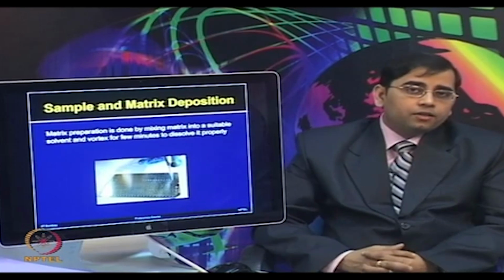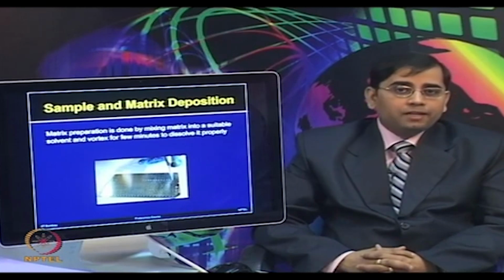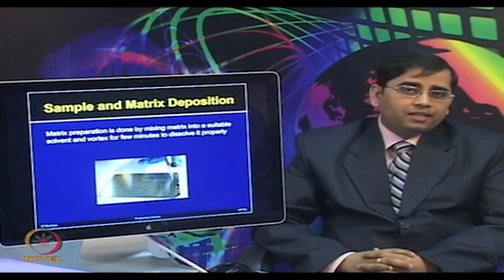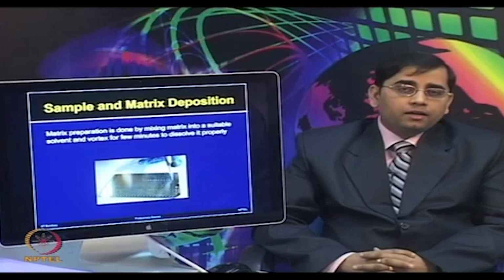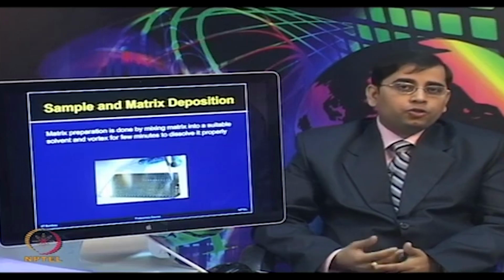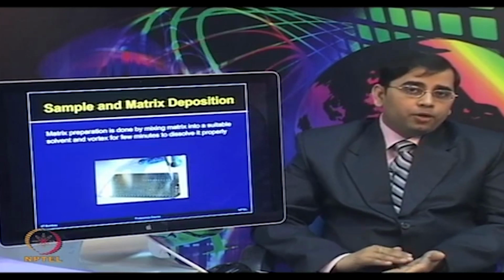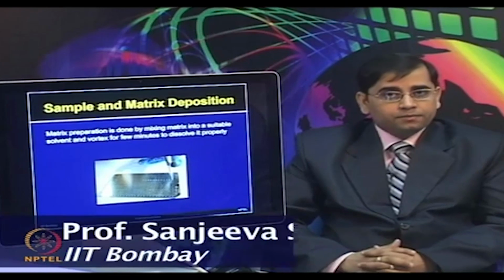Another way is the sandwich-based method, in which first a small amount of matrix is deposited on the plate, then you add the protein sample, and again the matrix is spotted on top of it, so that you have enough matrix below and above the analyte.